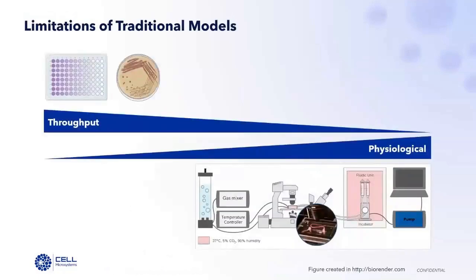Traditional in vitro biofilm models rely mostly on standard static cultures that don't support co-culture or physiological flow, lack control of temperature, gas, or nutrient gradients, and often require complex setups with pumps, tubing, and external regulators. These limitations oversimplify the true biofilm microenvironment. To overcome these limitations, we need experimental platforms that bridge the gap between static culture conditions and the dynamic environments in which biofilms truly form.